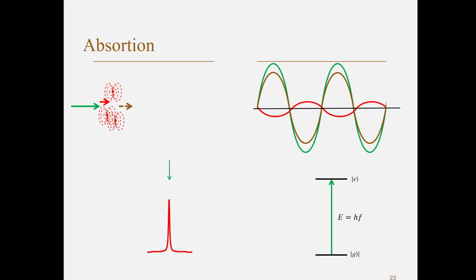And again, there were two contributions to the phase shift. 90 degrees phase after, as we see in the next slide, these are oscillating 90 degrees after in phase, and then there's another 90 degrees, which is a geometrical factor. And when we have a questioning hour later on, I'm very happy to discuss this geometrical factor. So please come and ask me if you're interested. But right now, we'll just say that there is a geometrical factor.